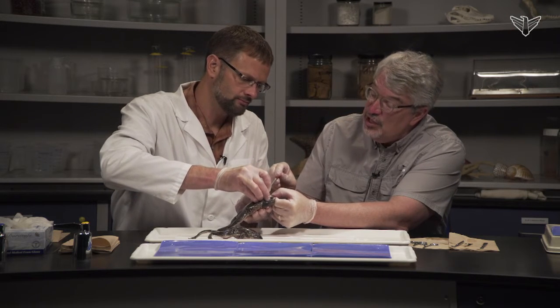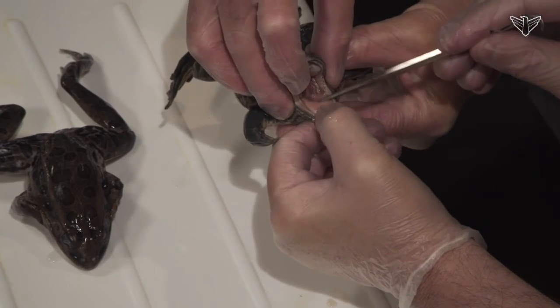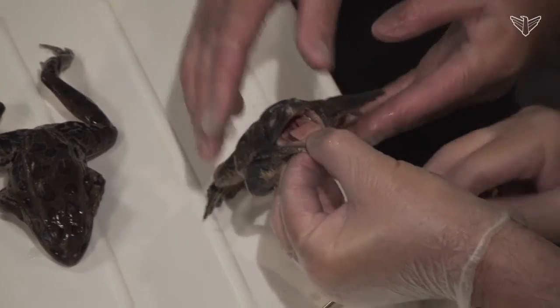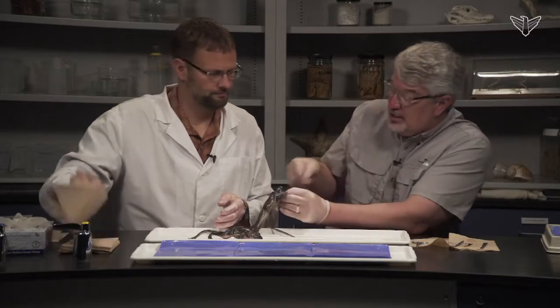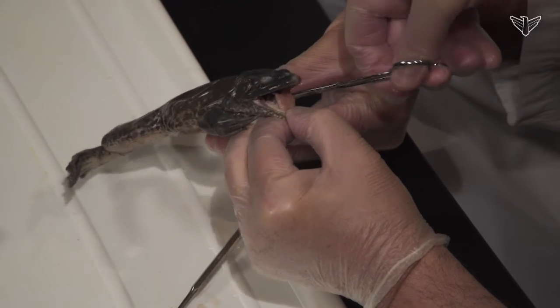And then, going to push some other stuff out of the way. You can see down here's the opening to the esophagus, so the opening to the digestive tract. And I don't know if we can get him down. We may have to open him up. As you're looking at these kinds of things, you may have to clip the jaws a little bit, and that'll allow you to.